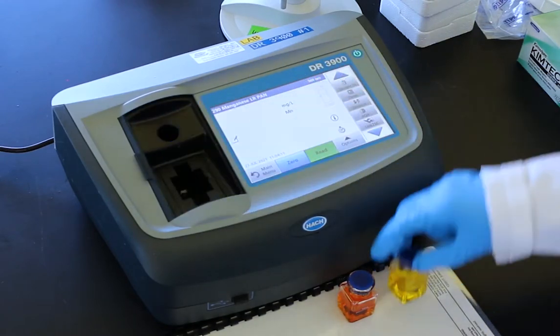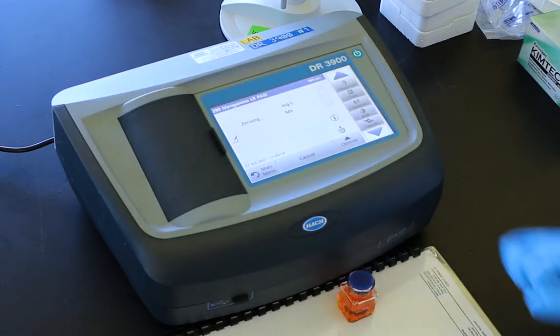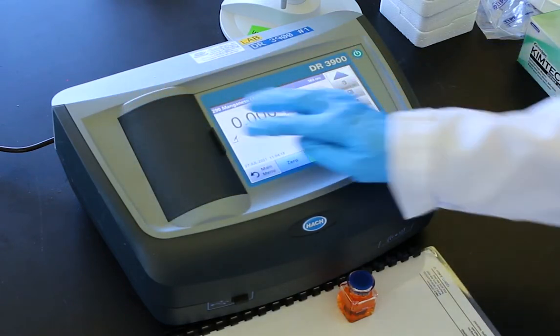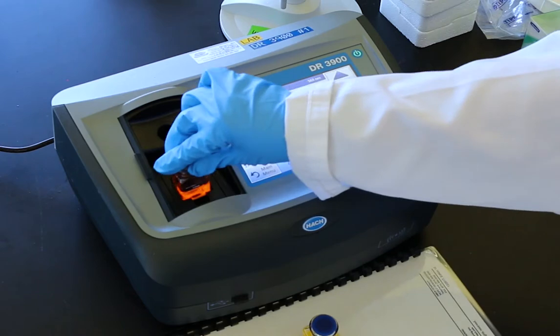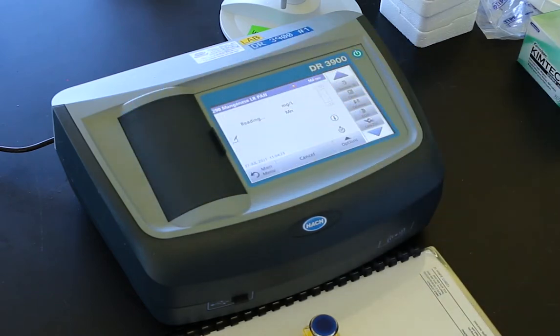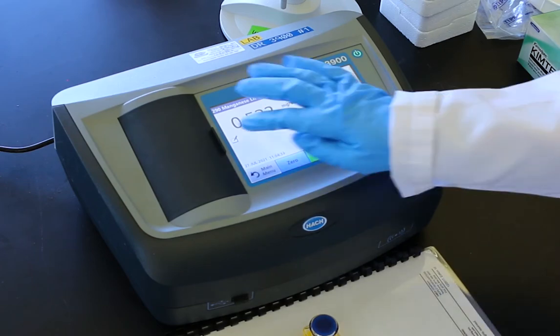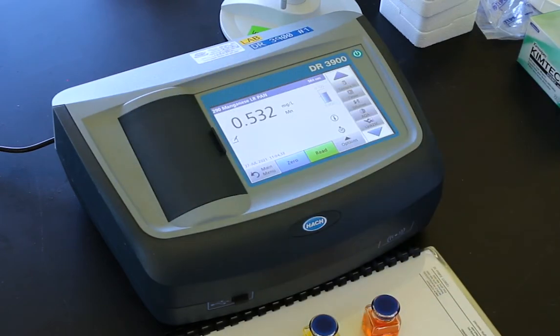Zero the instrument. Remove the blank and insert the sample cell. Press read. Record the sample result in milligrams per liter of manganese.